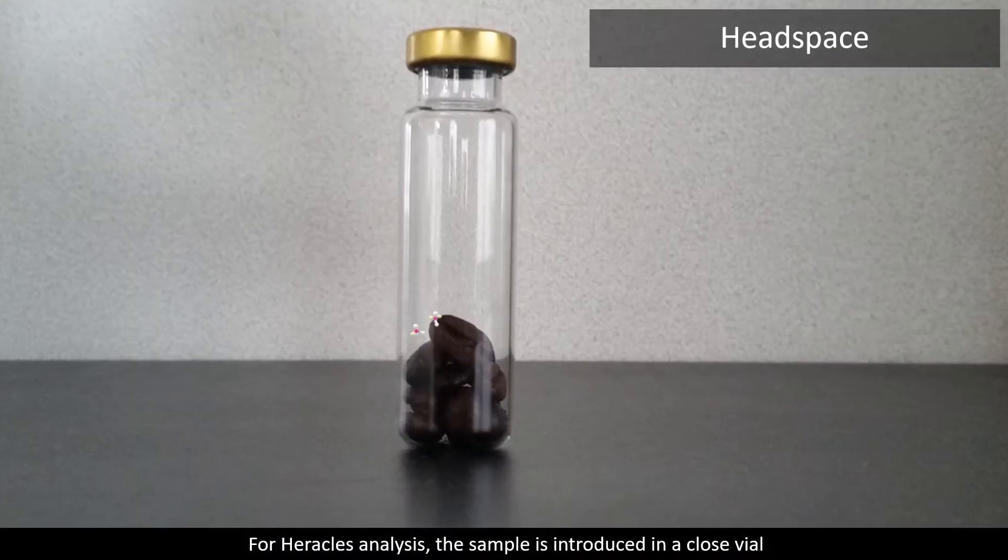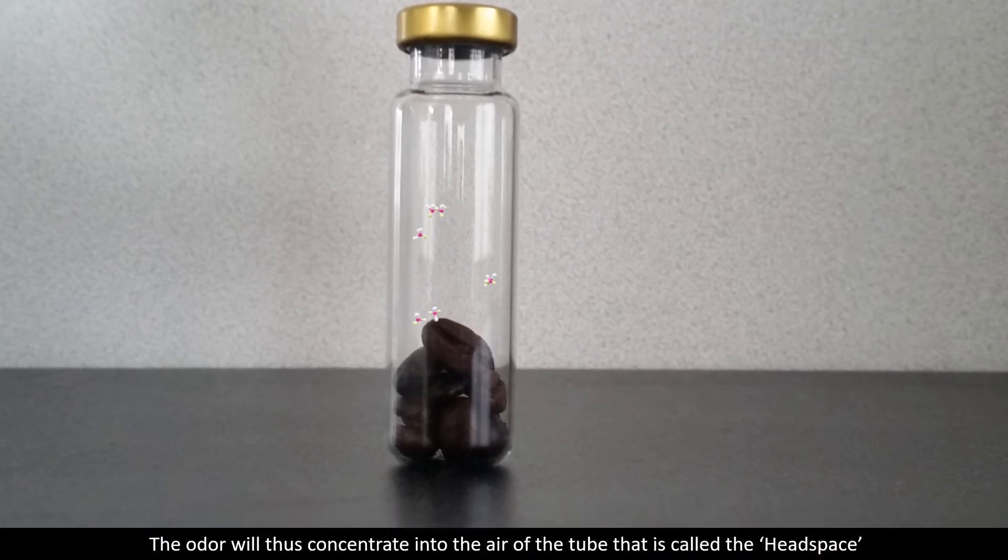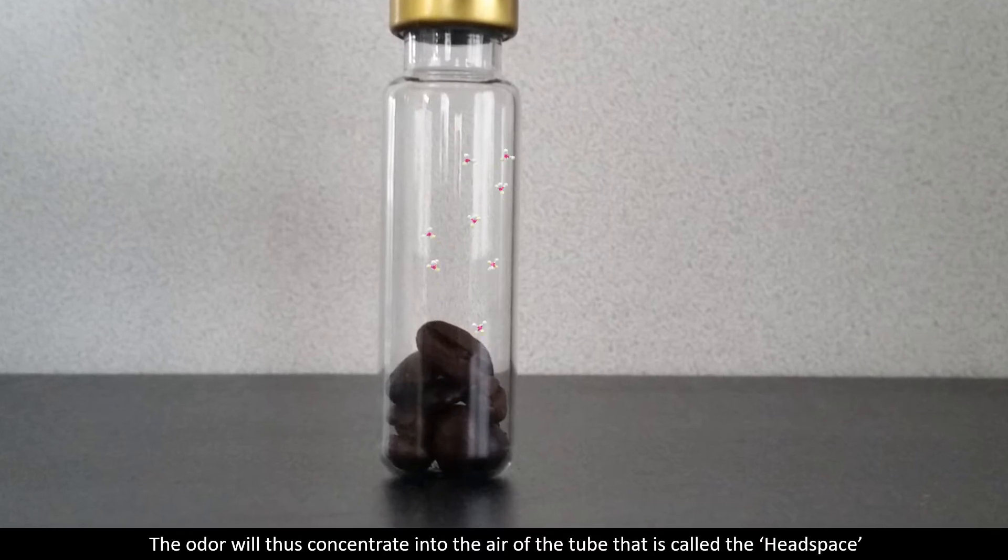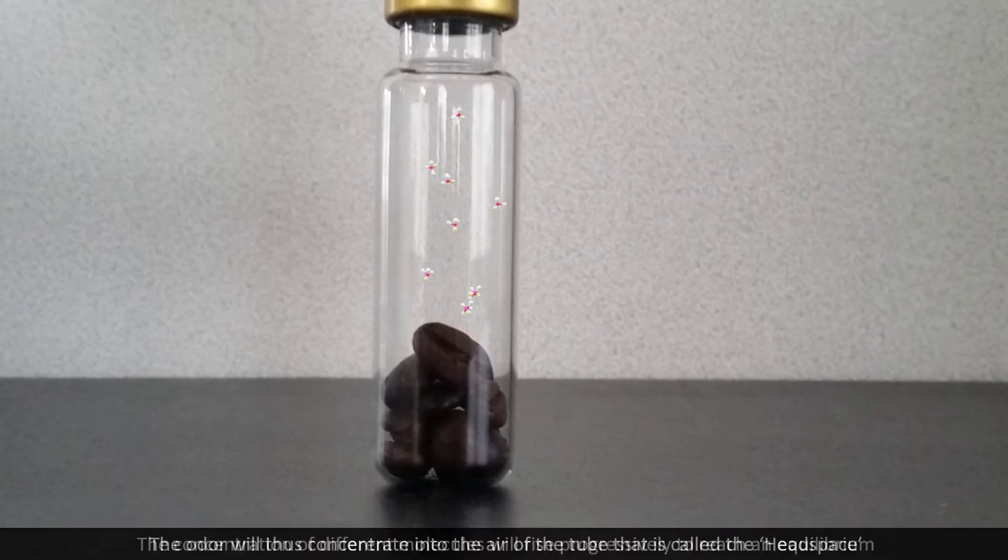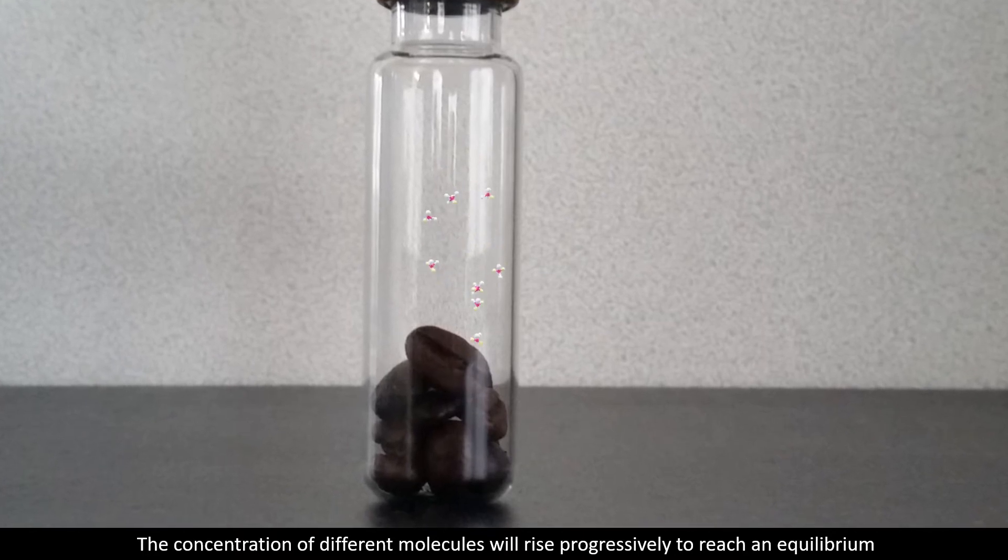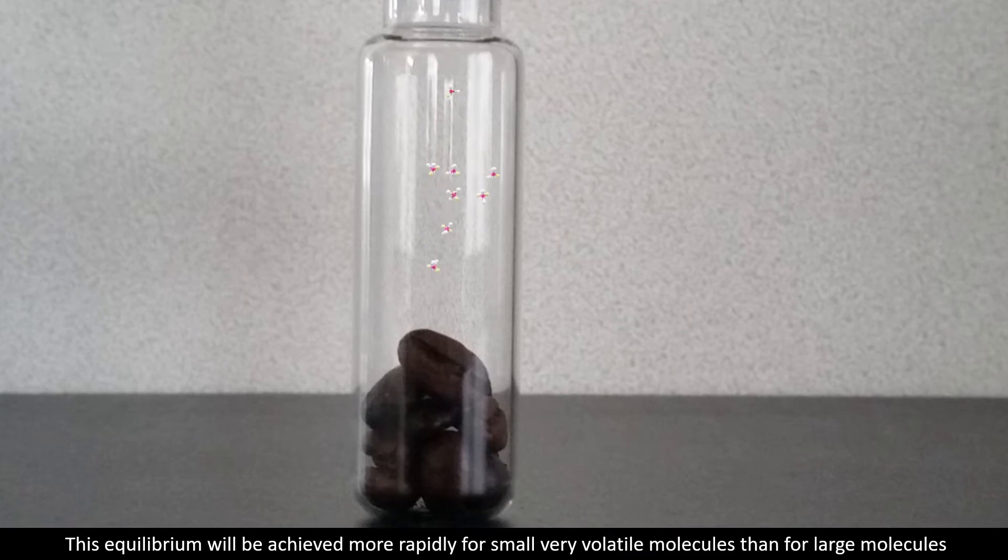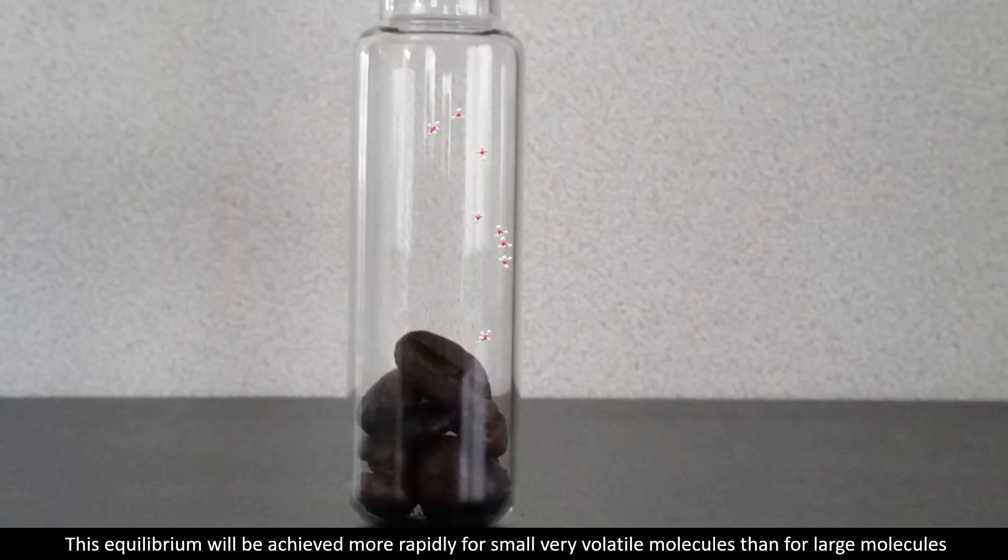For Heracles analysis, the sample is introduced in a closed vial. The odor will thus concentrate into the air of the tube that is called the headspace. The concentration of different molecules will rise progressively to reach an equilibrium. This equilibrium will be achieved more rapidly for small, very volatile molecules than for large molecules.